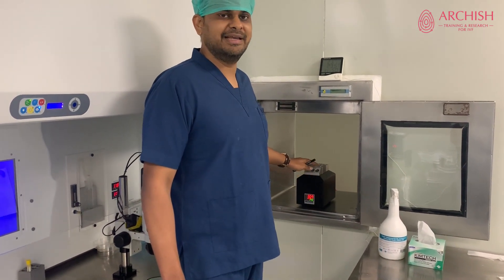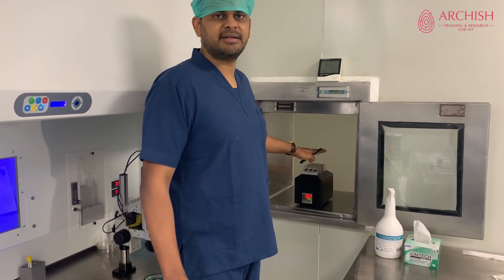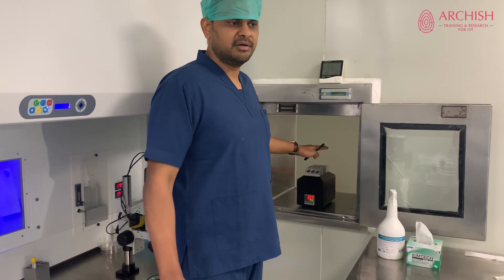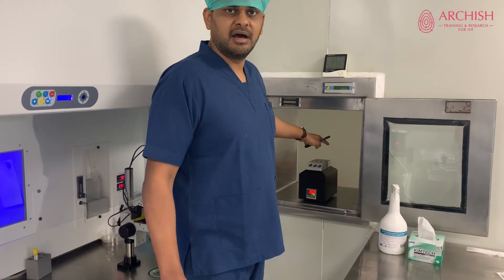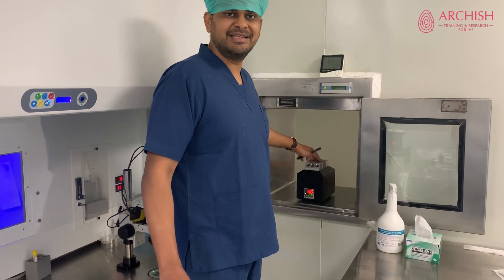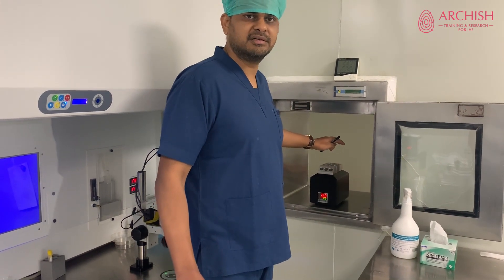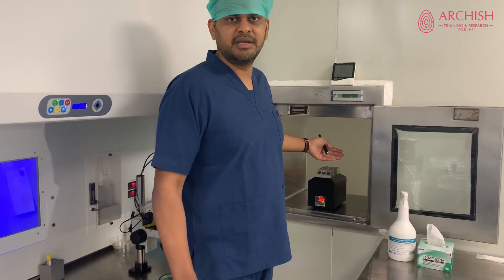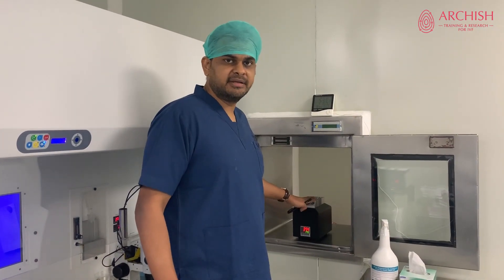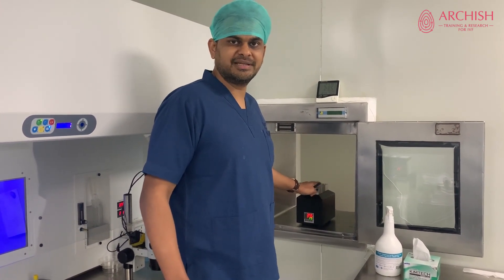What I want to check is the heating block — you can see it behind me. The heating block is an essential ingredient in your day-to-day practice. It is an intermediate holder for the fluid that you screen your eggs into. Once the egg pickup is getting done, the nurse will collect the fluid and keep it in test tubes in this particular heating rack. It is important that the blood inside these tubes along with the fluid is at 37 degrees, otherwise it will clot and you'll lose out on the important eggs. So the heating block is one of the primary instruments you need to verify is at 37 degrees.